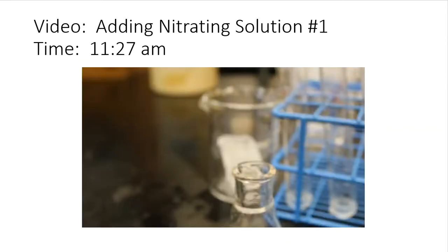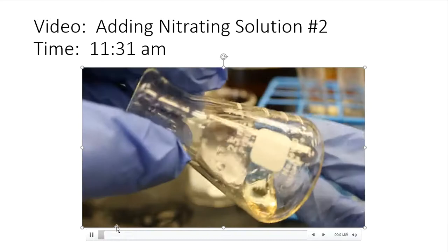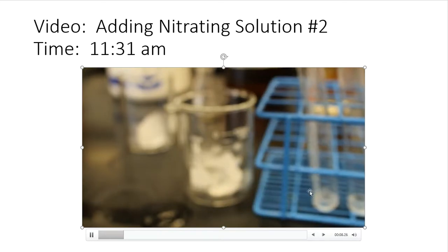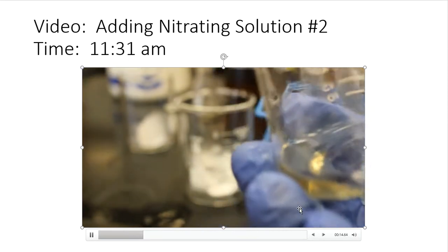And then I'm going to do the same thing for the other 2. So here is the second lab document that you'll be working on. This is adding nitrating solution to the methyl hydroxy blah, blah, blah, blah, blah. And this is at 11:31 that morning. Let's see if it does anything different. So that's original, starting out before the nitrating solution is added. And now in the background, you can see me get up the nitric. And we're going to slowly add it together.